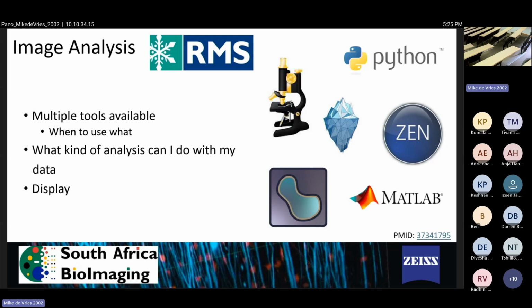So yeah, Chris again. I've got a few comments. Obviously, when we collect data, we see universities struggling. We have issues ourselves. I've got a lot to say, but I'll try and keep it really short. The two minor ones are on free stuff. I gave a talk today, if you weren't here, about a tool you can find by searching for CZI shrink, which can shrink Zeiss data down if you've got an old backlog, and you can contact me about it. We've also got Arivis Cloud for AI, where as a student you can get some free machine learning.